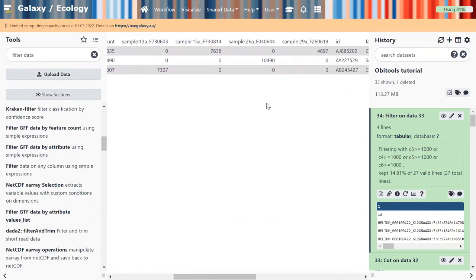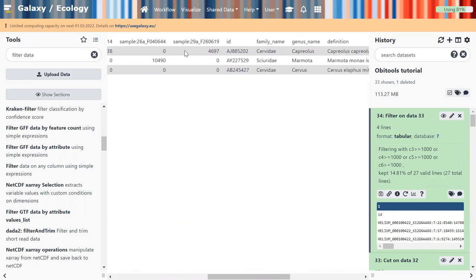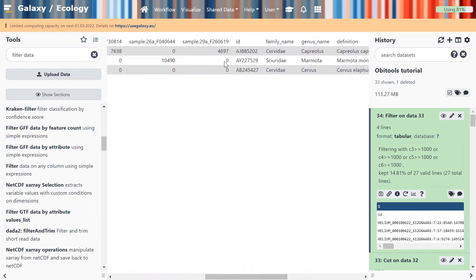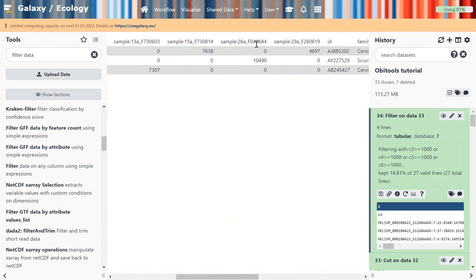Now we can say that for this wolf, we find this diet type. For this one, this one, the same, and this one, this. And to know what these wolves eat, we can see here, so, oh, marmota. I think it can be really good with some cheese or thing like that. So this sample, this wolf, it's a marmota.